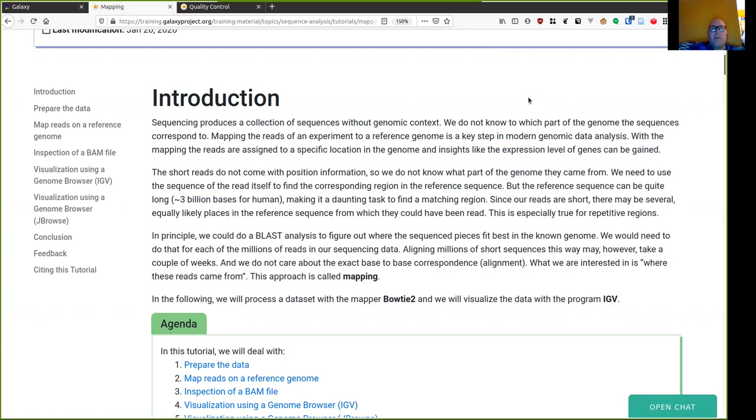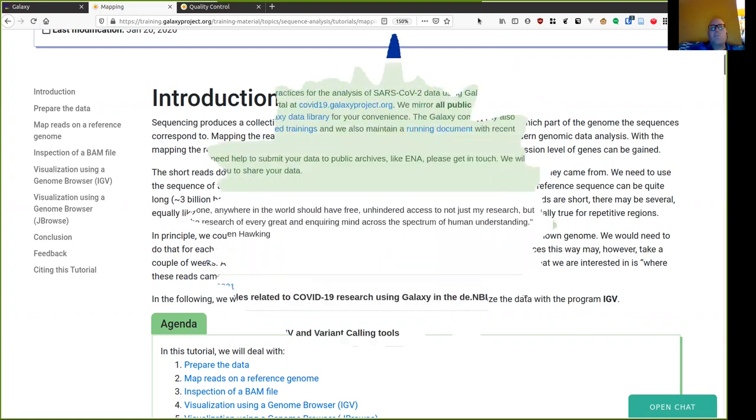As described in the theoretical introduction, sequence mapping is about finding the position of a sequence read on the reference genome using the sequence information and sometimes information about how the read was sequenced.